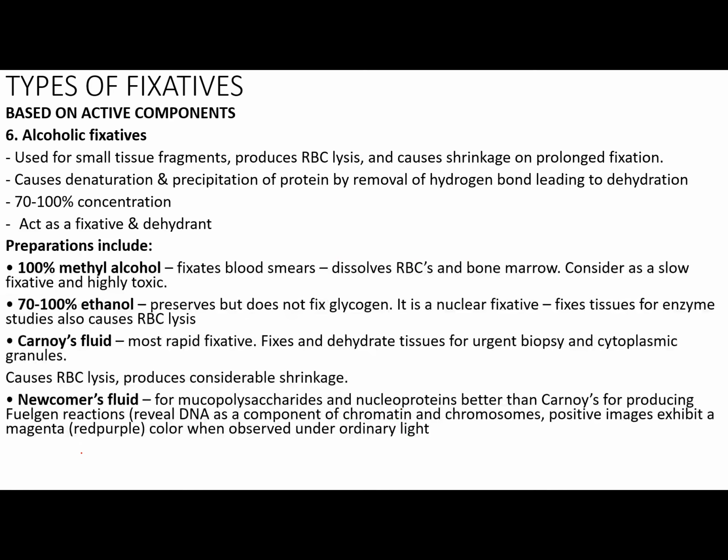Used for small tissue fragments, produces RBC lysis and causes shrinkage on prolonged fixation. Causes denaturation and precipitation of protein by removal of hydrogen bond, leading to dehydration. The concentration of alcohol fixatives would range from 70 to 100%. Acts as a fixative and a dehydrant. Now, variations or preparations would include 100% methyl alcohol. Methyl alcohol is always used for blood smear. It dissolves RBCs and bone marrow, considered as a slow fixative and highly toxic.